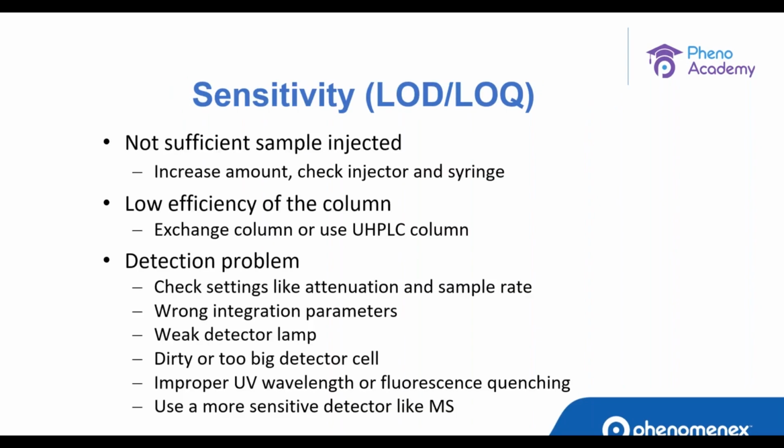In sensitivity problems, we normally use the terms LOD or LOQ. If the problem is low sample injection, we can consider increasing the injection amount, and checking the injector or syringe. For low efficiency of the column, we can consider exchanging the column or using UHPLC.